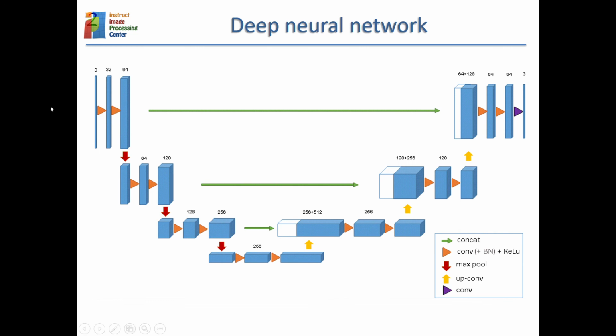So, for instance, here you're convolving with 3 different kernels, and then you are convolving with 32, producing 32 layers, and then convolving with 64 kernels to produce 64 layers, and then you can make a max pooling, for instance. This max pooling is just a sampling, and we have seen all these operations. This just gives you an idea of how complicated these things can be, but at the end, if you are able to estimate all those weights, they can be very powerful in making regressions.